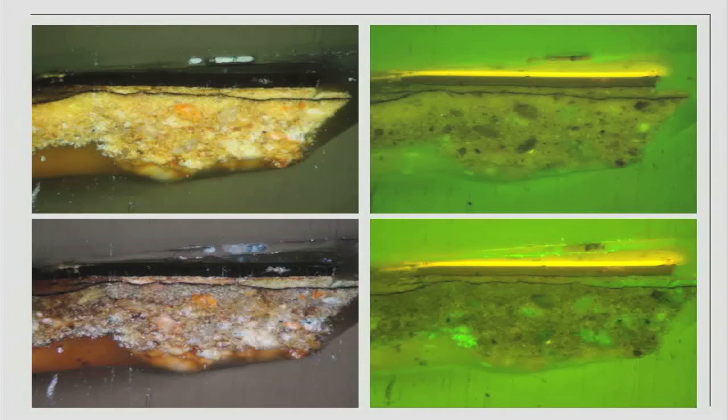Here are all the four images that were taken of this sample so far. The top row shows the sample before staining and the bottom row shows them after protein staining. Please note that the subtle darkening of the lower sample images derives from a previous staining for starch and is not a result of positive staining with Amido Black.